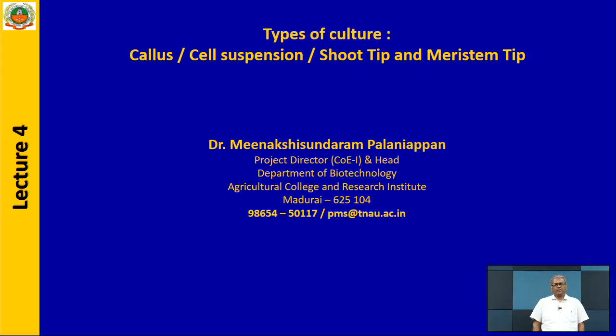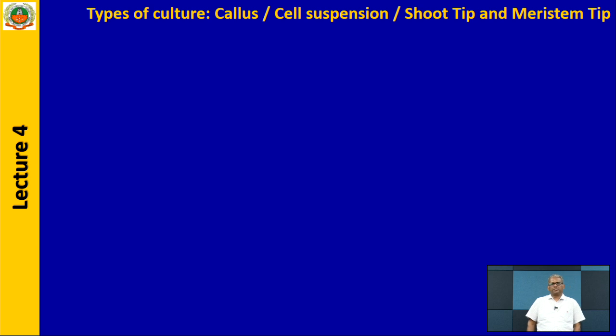laboratory. We all know tissue culture is an applied biology wherein we try to multiply our target plants on a large scale. So, what we do in tissue culture is we try to begin with an explant, which is nothing but a small bit or a piece of a plant which is inoculated onto an artificial medium with the objective of either mass multiplying plants or producing secondary metabolites or using them for storage for a longer time.